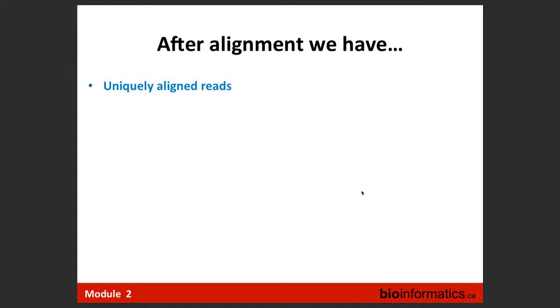So now say we have aligned reads. Imagine, and it happened to me recently, I take the file after alignment, and I have zero reads aligned. What can it be? Wrong species. Wrong species, that's a good thing. Like, for example, the wrong genome was used. Mouse and human would probably still have some reads aligned, but something went really wrong. Or it was actually SOLiD reads, but I thought they were Illumina reads. So it could happen. Just check.